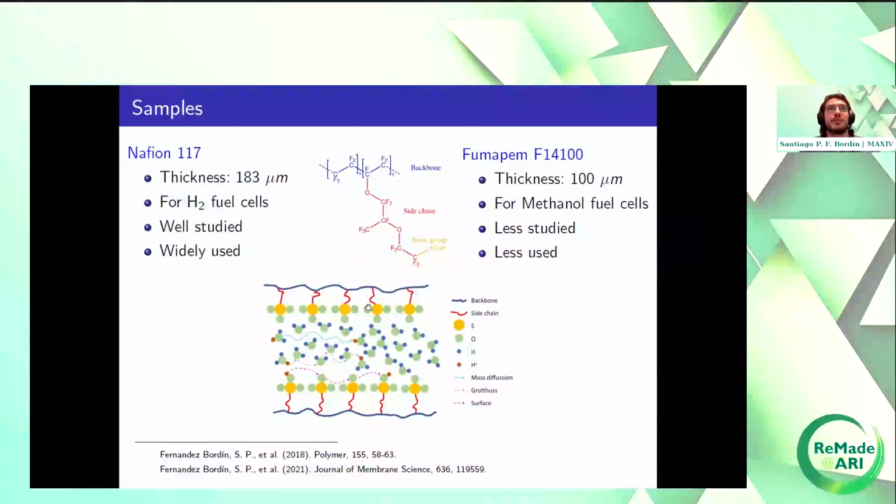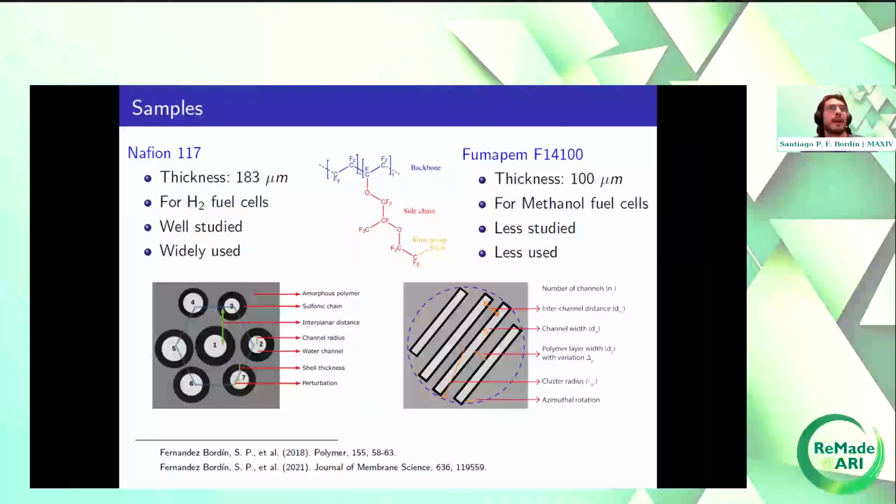Even if these two membranes have similar properties and similar structure, their water channels take different shapes.